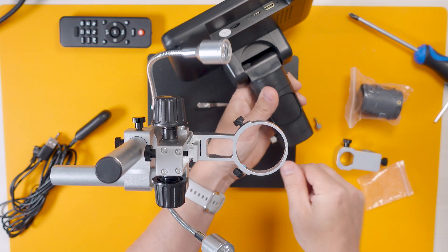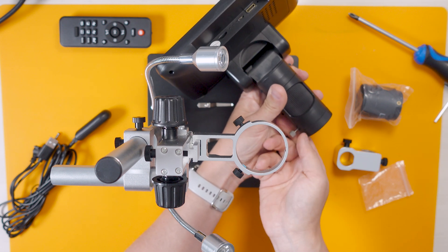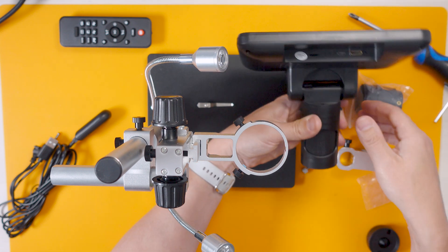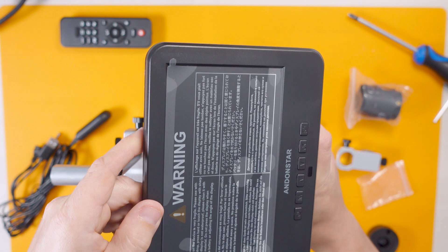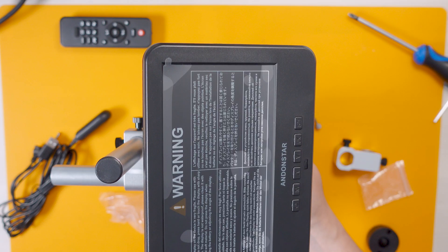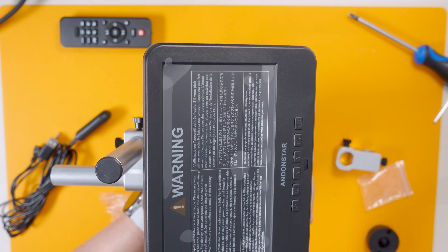This actually comes with three different lenses, and for printed circuit boards you've got to use Lens L — so I've got Lens L ready. You can actually do proper microscopy with this, including looking at bugs and slides and things. This is looking like an actual microscope now. So let's pop Lens L in, screw it in position — blindly looking for the hole.